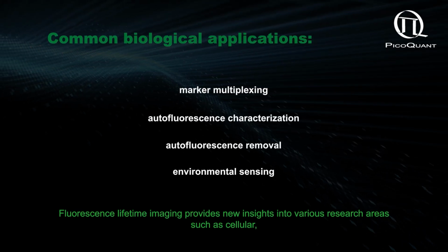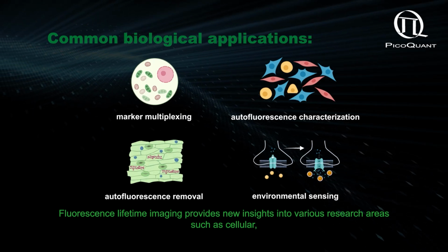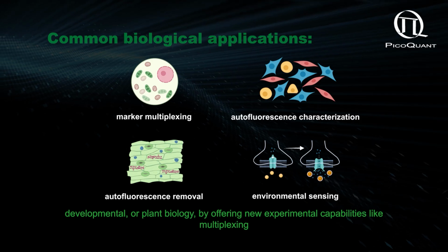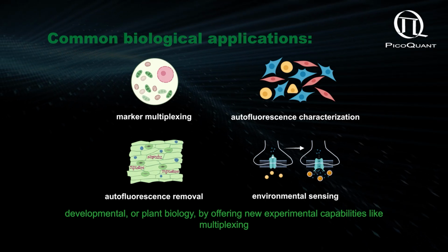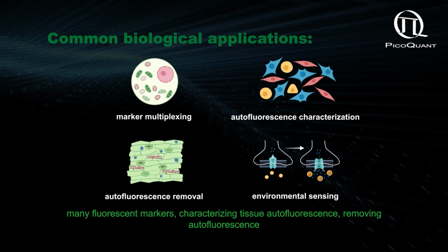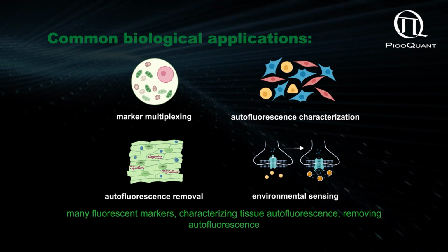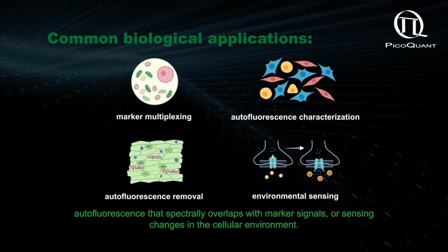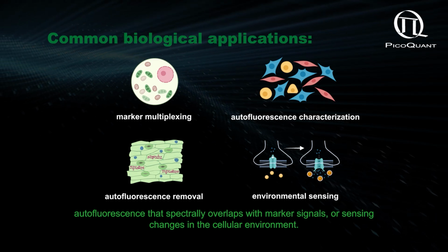Fluorescence lifetime imaging provides new insights into various research areas such as cellular, developmental, or plant biology by offering new experimental capabilities like multiplexing many fluorescent markers, characterizing tissue autofluorescence, removing autofluorescence that spectrally overlaps with marker signals, or sensing changes in the cellular environment.